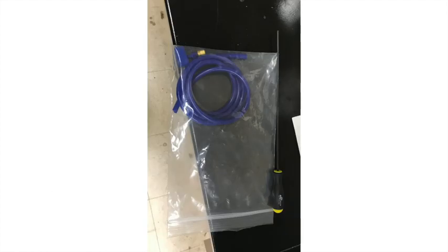What I decided to take an IR of is this plastic bag, which was back in the IR room. It has a blue tube in it. This tube is meant for, if we wanted to, hooking up a nitrogen gas tank to our IR and having a slow flow of nitrogen gas into the chamber with the ATR adapter, where you put your sample. The reason for that is if you want to get all the moisture and CO2 out of the air around your sample.